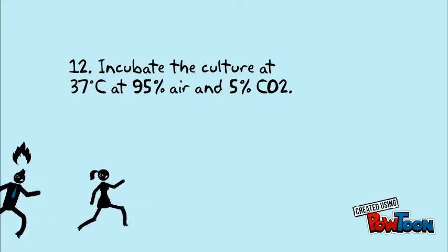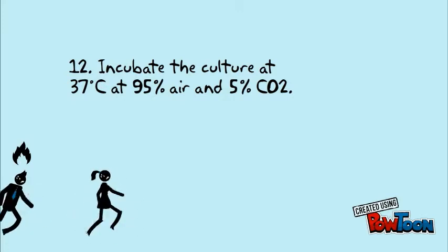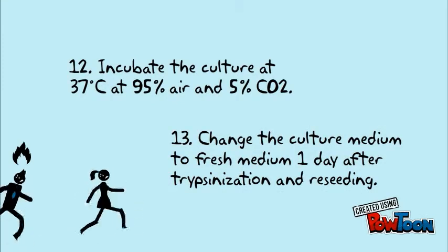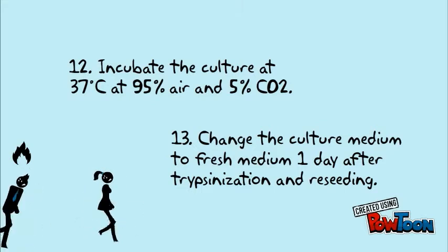Incubate the culture at 37 degrees Celsius in 95% air and 5% carbon dioxide, and change the culture medium to fresh medium 1 day after trypsinization and reseeding.